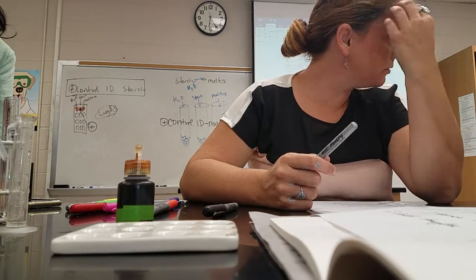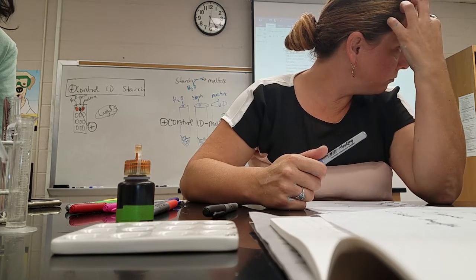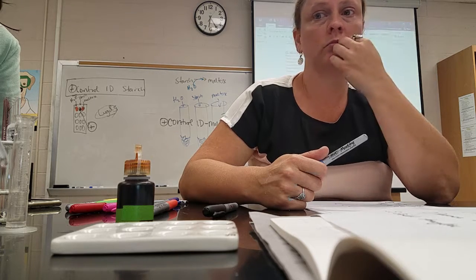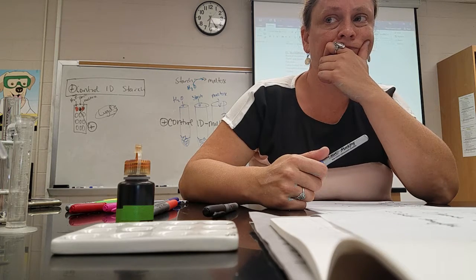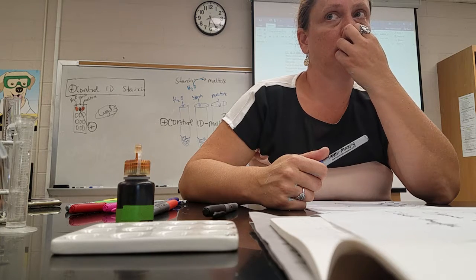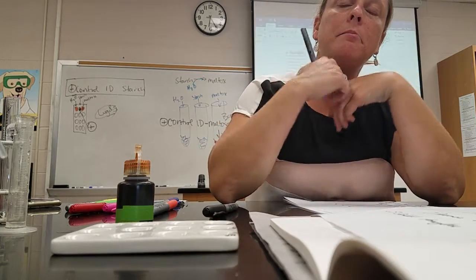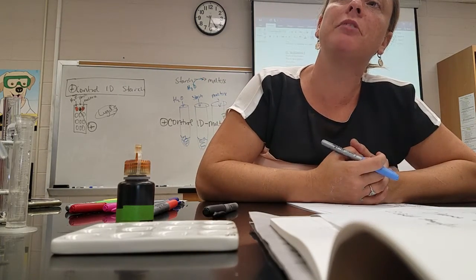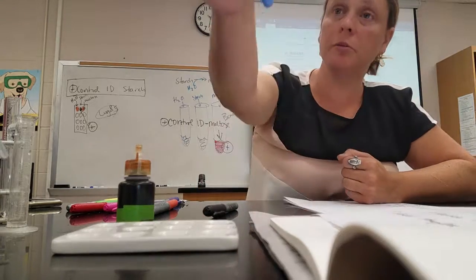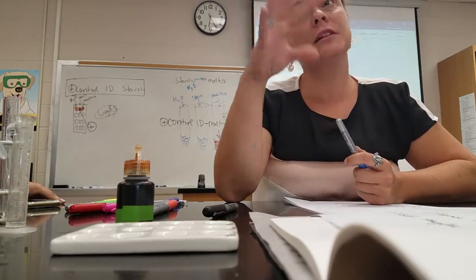Do you guys have all the solutions that you need? Because we have some here. Is that 2? It looks like 2, but the lines are not 2. The lines follow centimeters, which is different. Those do not follow your milliliters. Okay. Before we did the marks, you can really do either way.